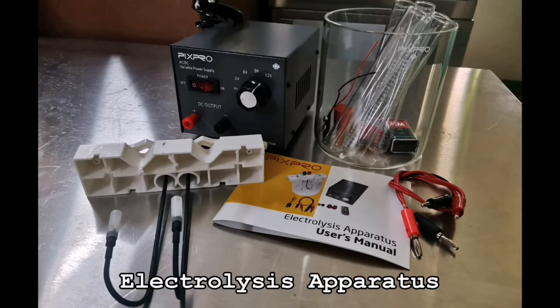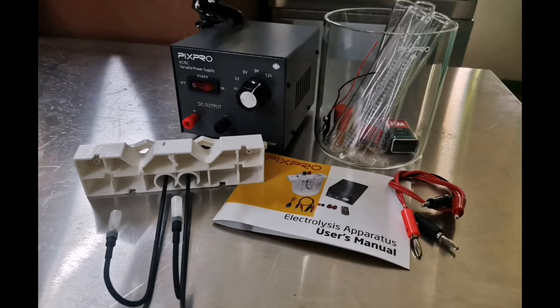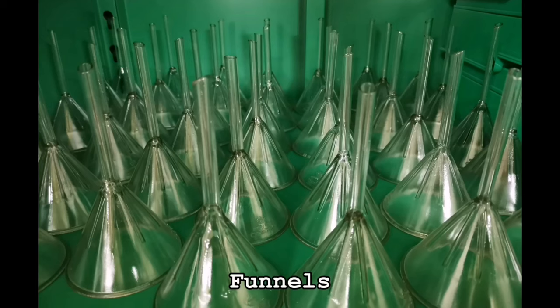Electrolysis is a technique that uses direct electric current, DC, to drive an otherwise non-spontaneous chemical reaction. Electrolysis is commercially important as a stage in the separation of elements from naturally occurring sources, such as ores, using an electrolytic cell. A funnel is a tube or pipe that is wide at the top and narrow at the bottom, used for guiding liquid or powder into a small opening.